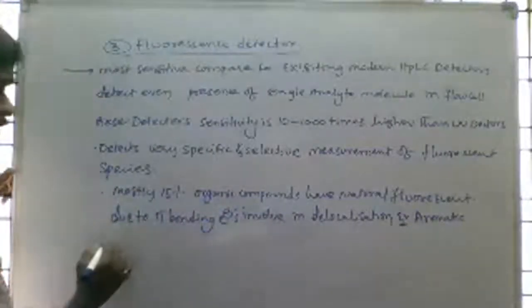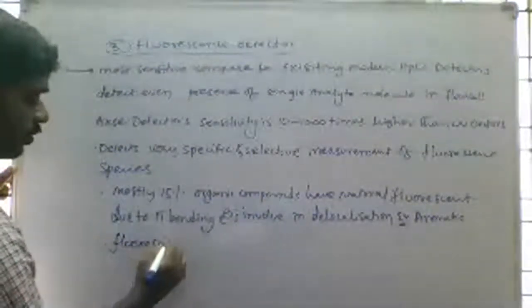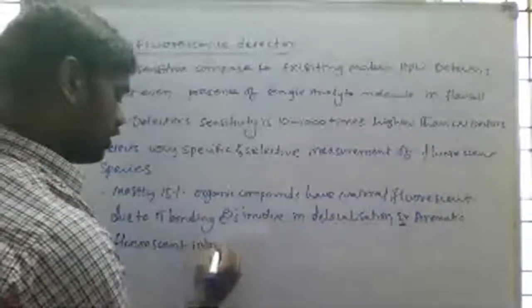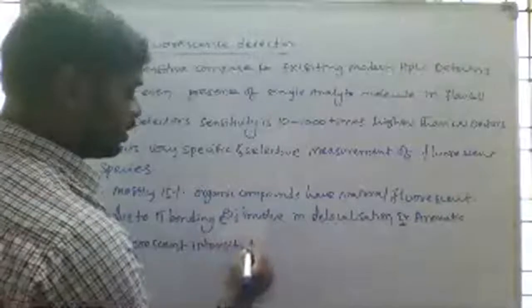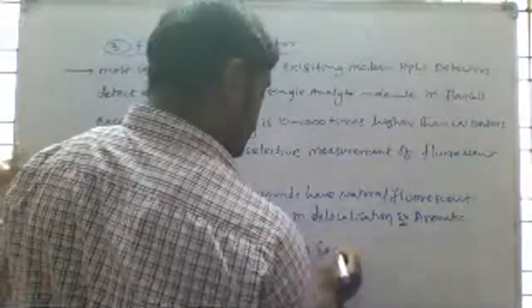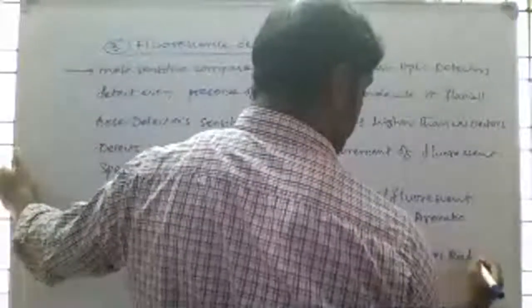One more point: fluorescence intensity depends on the excitation and emission radiation wavelength.